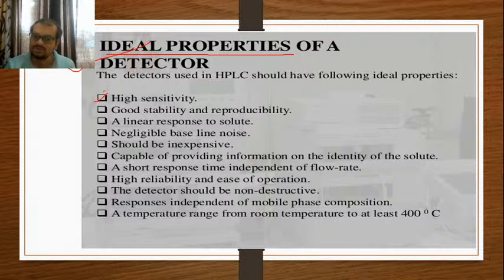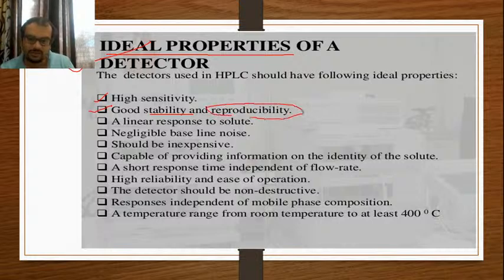It should show good stability and reproducibility. No doubt about it, your detector system needs to be stable and it can reproduce the results. Okay, reproducibility, remember the analytical validation term. In case of reproducibility, it should be reproducible with the same range of analyte presence.